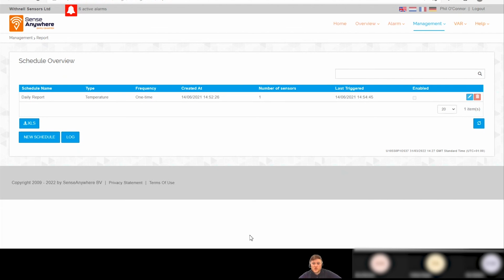But this is just a free version if you wanted to have an internal document of what the sensors were. Okay, so if you wanted to beef up your report, you just use a credit for that, is it? Yeah. You can place the loggers where they need to be, run the report, and we can run the mapping report on this side, input all the data and stuff like that.